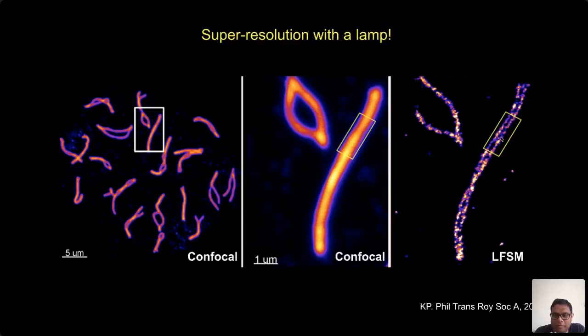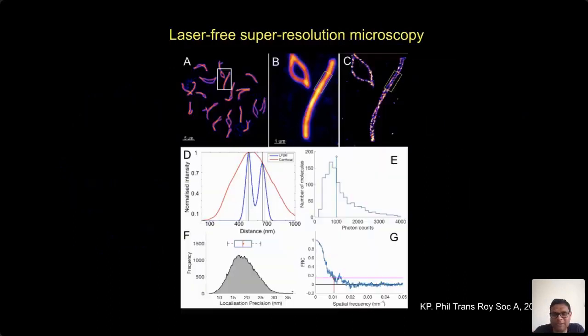So these are very good biological objects, unlike beads and other slides, all the slides that we saw. Those are good, but you need some real biological samples, and especially good diffraction limited objects, right? Which have structures below 100 or 150 nanometers. So we could not only resolve the 2 strands, but also see the individual strands, which fits well with the EM data, because we are hitting 60 nanometers with a lamp on an ordinary fluorescence microscope.